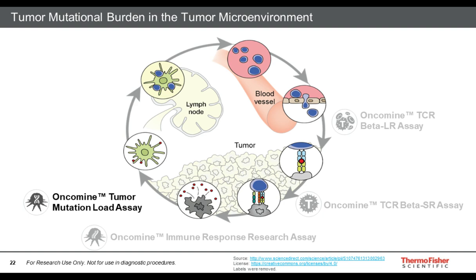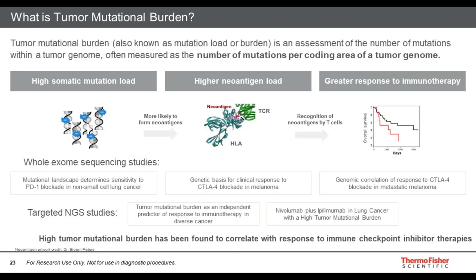So lastly, I'd like to move on to describe the tumor mutation load assay. This is another assay focused on the tumor microenvironment, this time for characterizing the cancer cells within the tumor microenvironment.